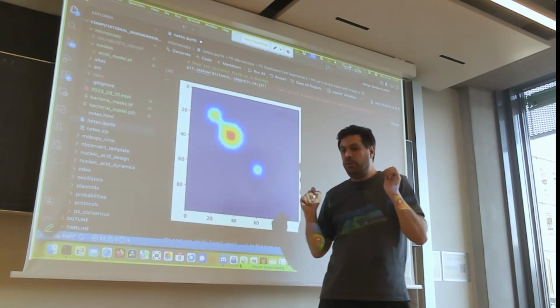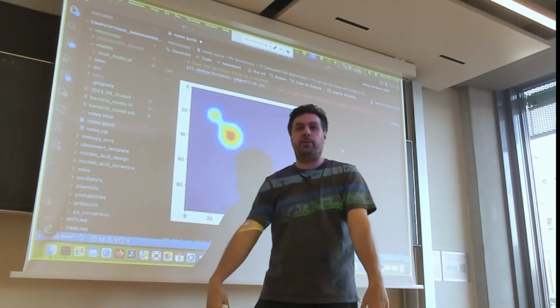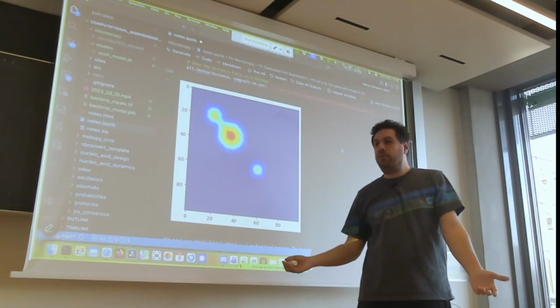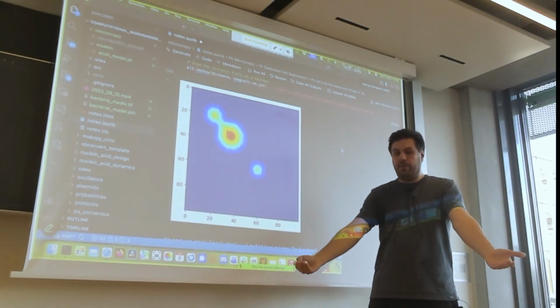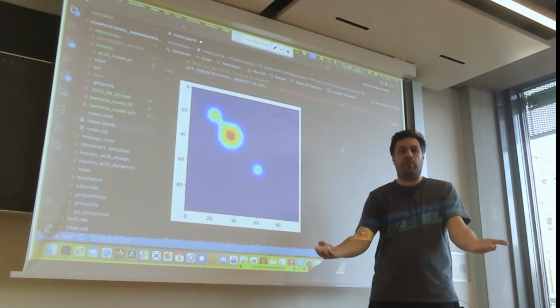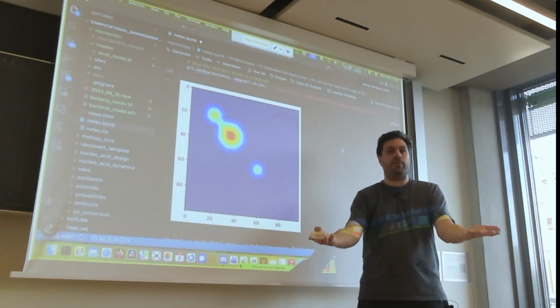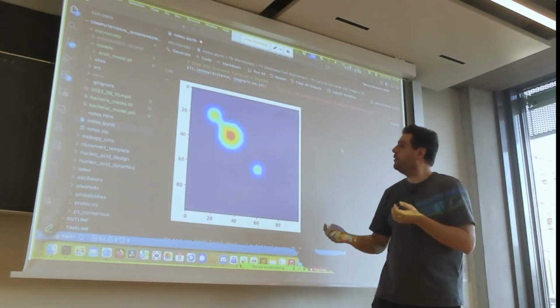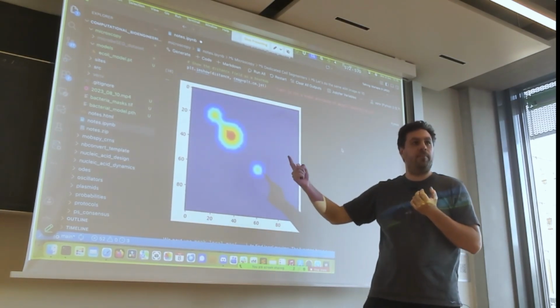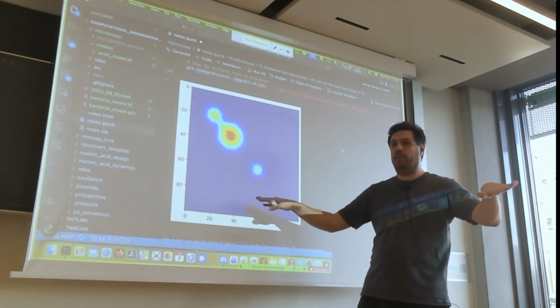And now you can think of like reversing these mountains, like putting them actually as holes and not as mountains. So like just negative distances. And now you start to fill up from the maxima, or the minima in this case. You start to pour in some water. Let's say you let it rain, and the levels rise. And this is what this watersheding does. So you can think of this hole starts filling up, this hole starts filling up, and this hole starts filling up. And of course, this fills up until it kind of reaches the sea level of 0.